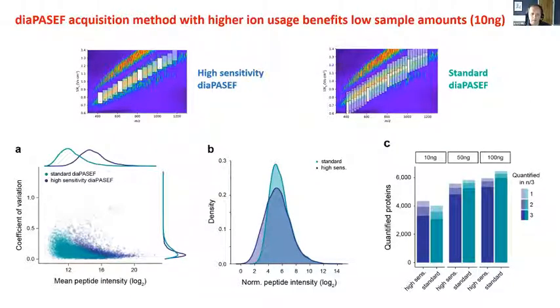And my understanding is that the people who have had the instrument for a little bit longer also are not really cleaning beyond this dielectric capillary. So from a robustness perspective, my experience has been pretty good.